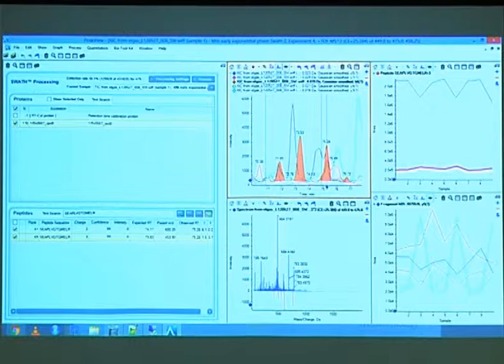So if you have an assay that falls in the overlap, you get the ID twice, and there you should see something similar, so that one should be identified at the same retention time with the same areas, or similar areas. But yeah, if you have the one in the window overlap, you should also get rid of the interferences, because it's very, very unlikely that you have two peptides eluting that are that close together. It might still happen.